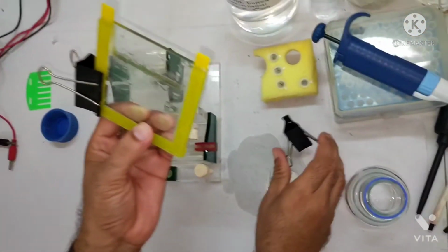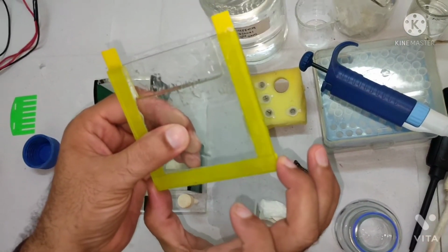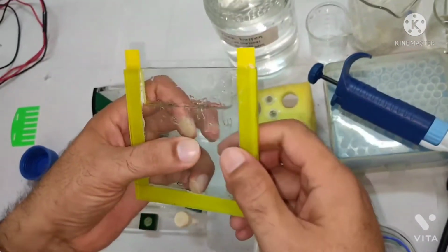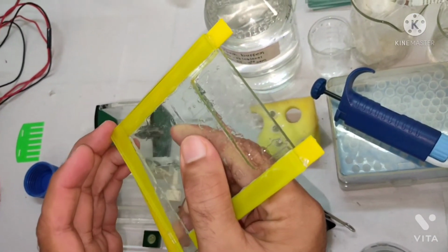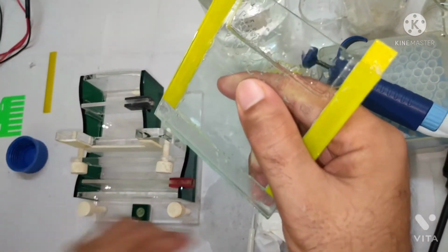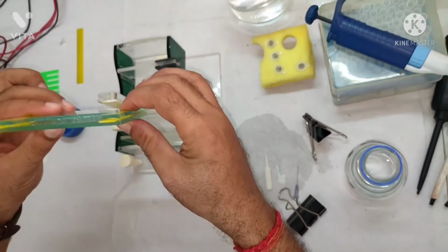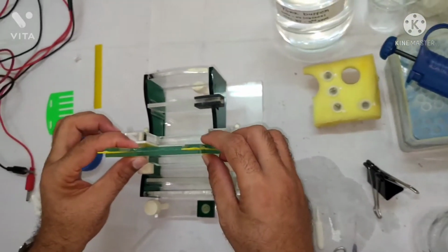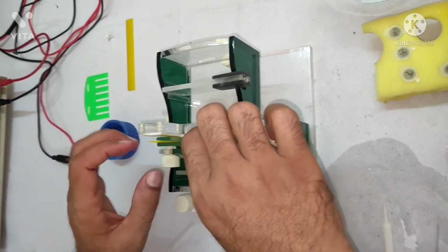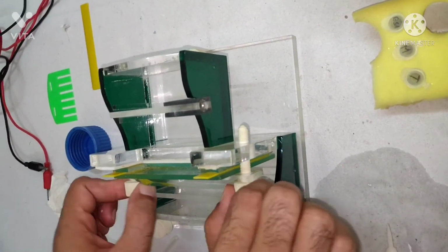Okay, so now what you do, you just remove the clamps. I'm removing the clamps, right? And after removing the clamp, you should remove the lower spacer, so that current will make a circuit, right? So this is the lower spacer, right? And now you put the gels, notch should be towards the well, this tank. So this is the small tank, so I'm fitting like this, right? ये इस तरह से fit करना है. Then you tighten it, right? So I'm tightening.